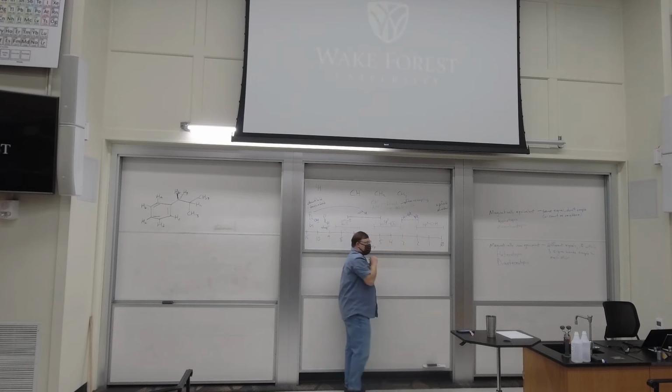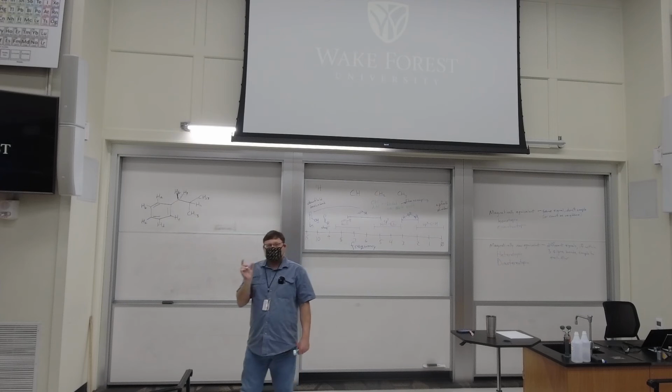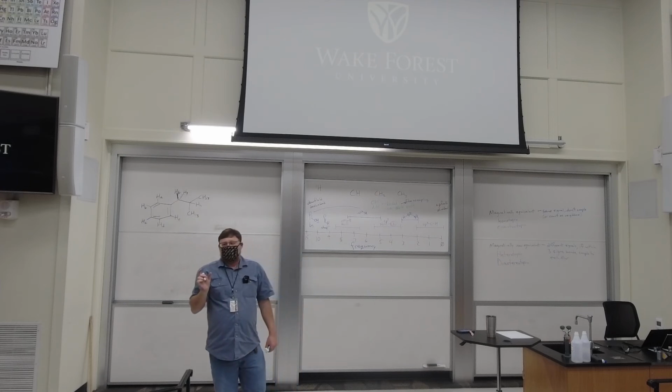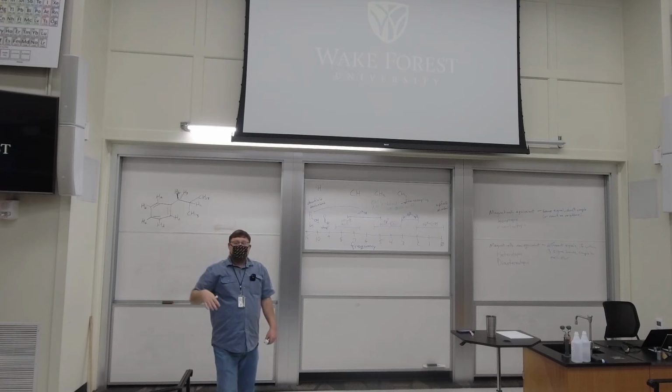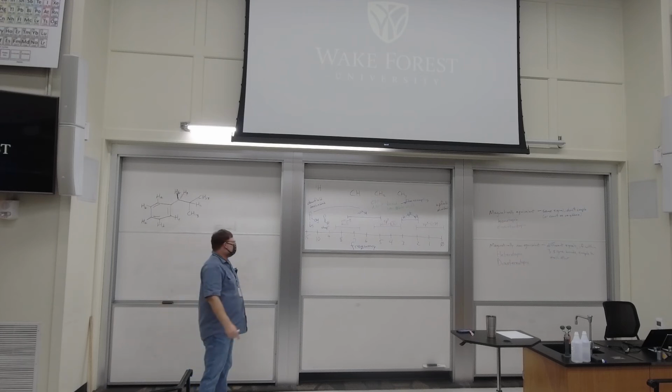Protons on an sp3 carbon that are bonded to an sp2 carbon come 2 to 3. And then protons that are just kind of on sp3 carbons bonded to other sp3 carbons, you know, the workhorse, the alkane, the hydrocarbon, those are like 0 to 2. That's all you need to know. There are way more numbers you could know, and you could know it like 5.4 to 7.8, but all that is hard to stick in your head, I think.